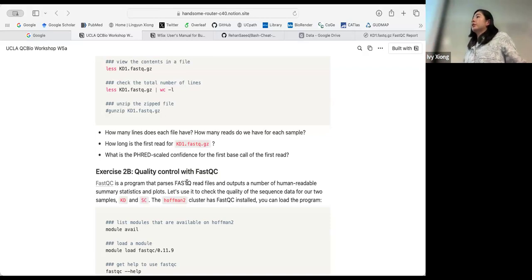But it's still comparable, because we can do normalization to minimize or control for sample variation. So as long as they didn't fail, it can be used and aggregated, and compared across different samples, different organs or different tissues.